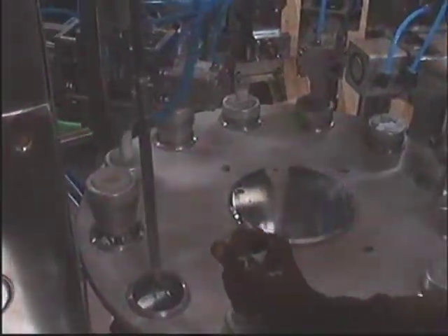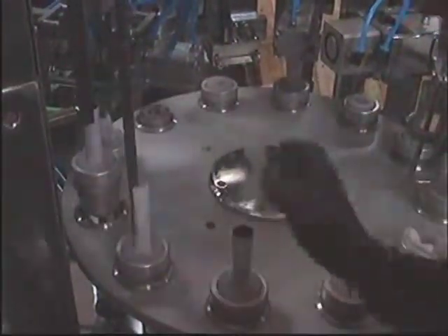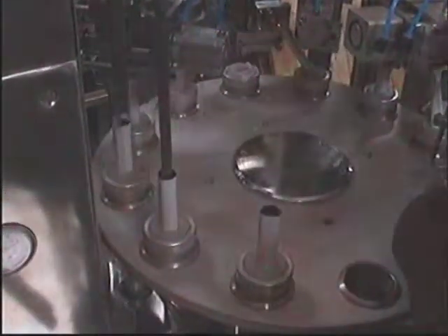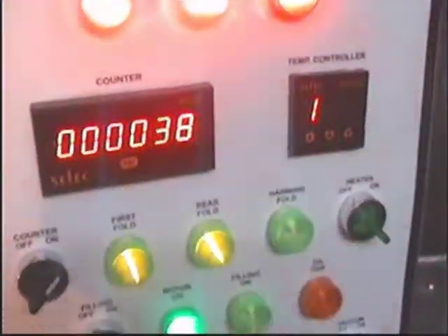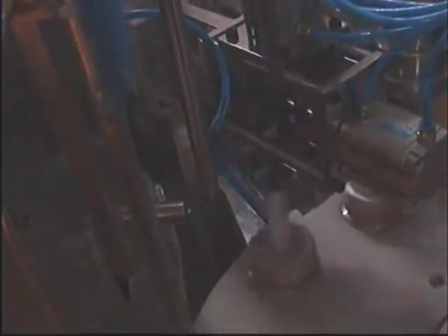You are seeing the machine in operation. You are seeing the filling in operation.